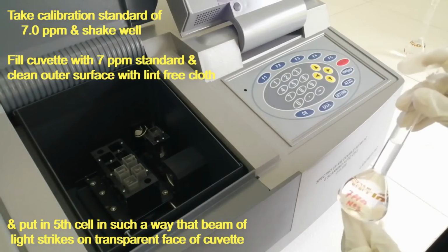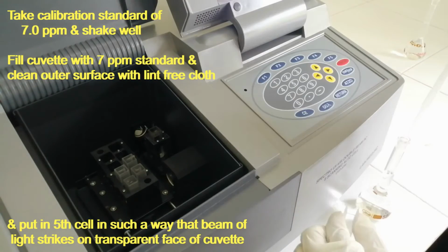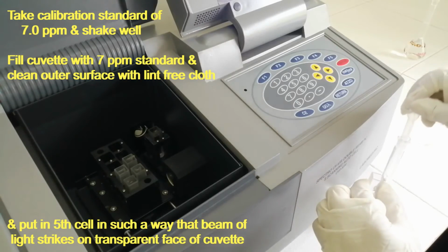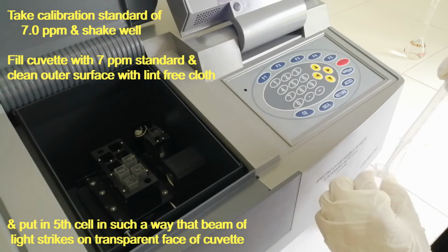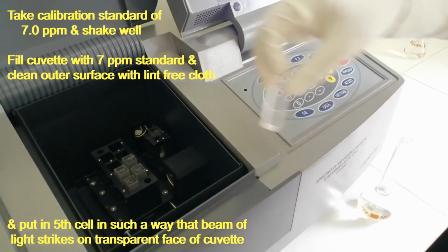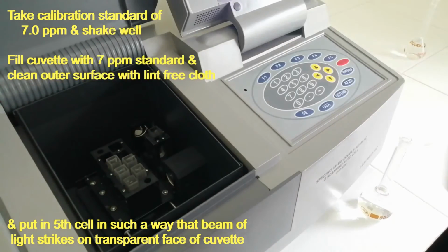Take calibration standard of 7.0 ppm and shake well. Fill cuvette with 7 ppm standard and clean the outer surface with lint-free cloth. And put in fifth cell in such a way that the beam of light strikes on the transparent face of the cuvette.